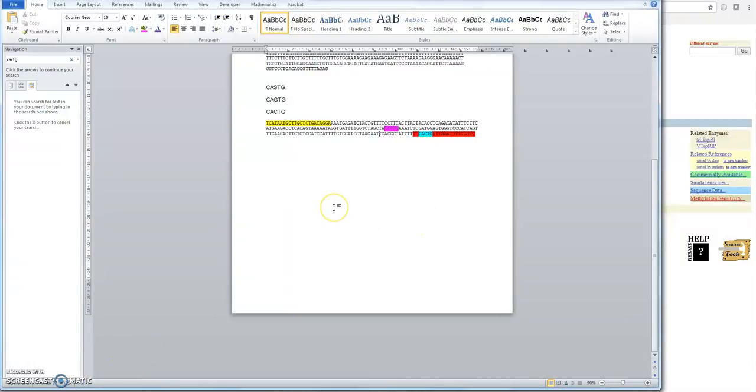Okay, so part 2 of the bioinformatics session. Just to remind you where we're up to, this is your PCR product sequence. We've added the restriction digest in the lab and we've digested the DNA, your PCR product, and this is the wild type normal sequence, and it should have cut twice.